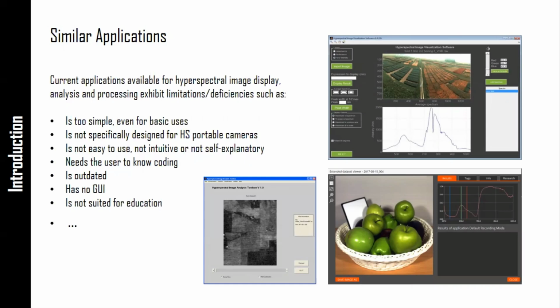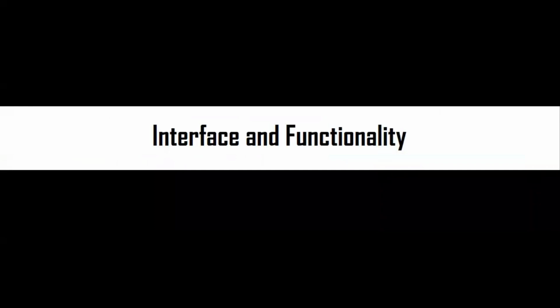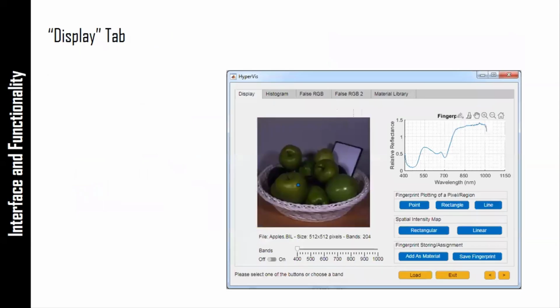For instance, some software is too simple, some is too complex to use, some has no GUI, and some is not free. So we try to solve these. The interface of the application that we worked on consists of different modules.